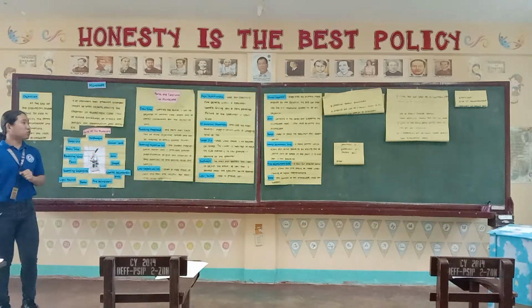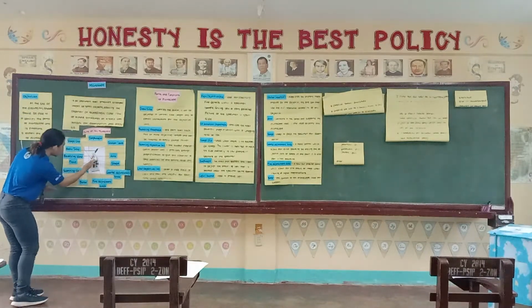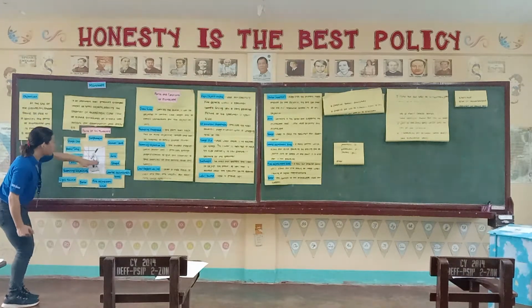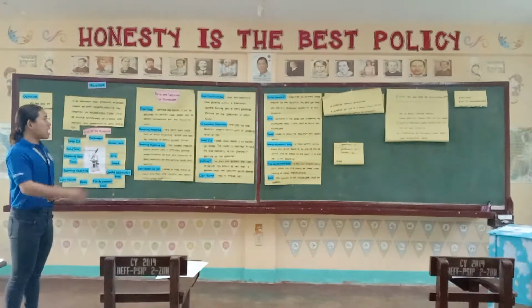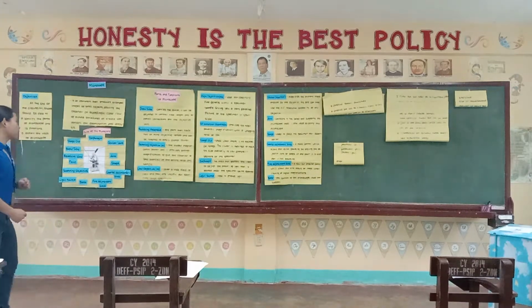So the arm is used to support the head. Meaning to say, this is the head composed of the revolving nose piece, the body tube, the ocular lens. So this is the upper part of the microscope, or the head of the microscope. So the arm is very useful to connect and to support the microscope head. And it is also used to carry the microscope.